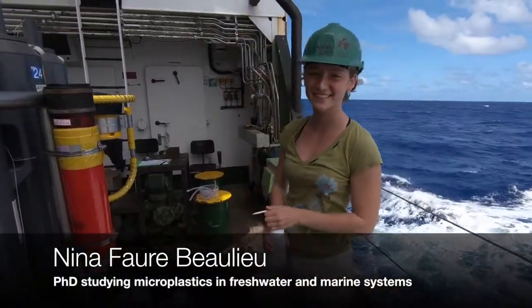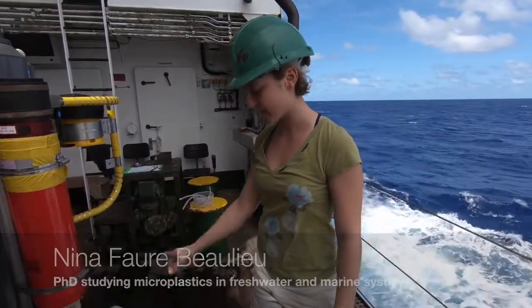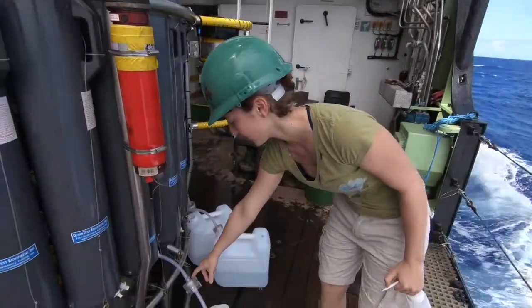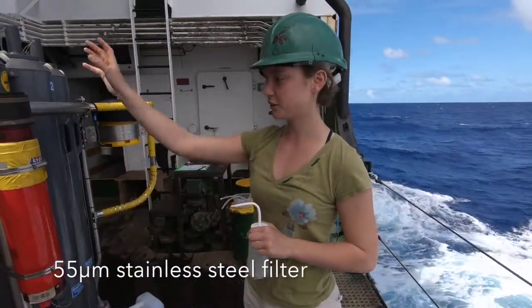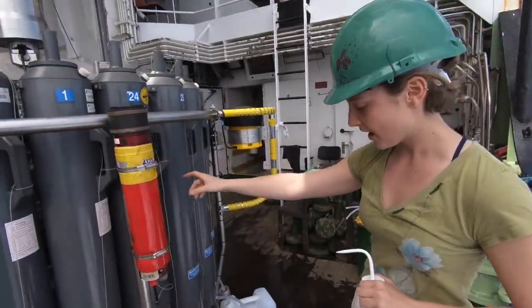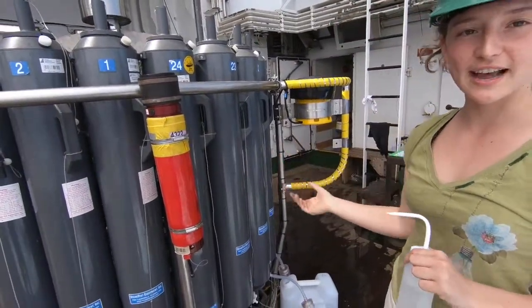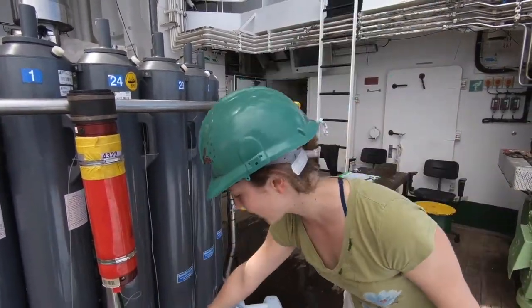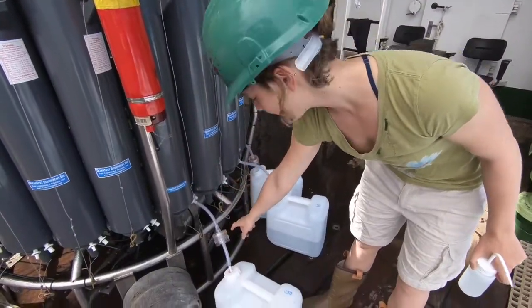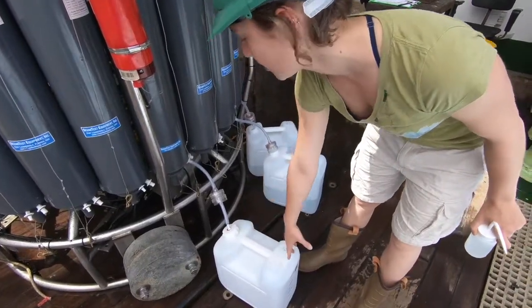I'm sampling for microplastics. I'm using a filtered water bottle which has a 55-micron filter inside to filter the water from this Niskin bottle without it coming into contact with the outside air. Water is going through the Niskin bottle, pulled by gravity, into the filter and then into this enclosed carboy.